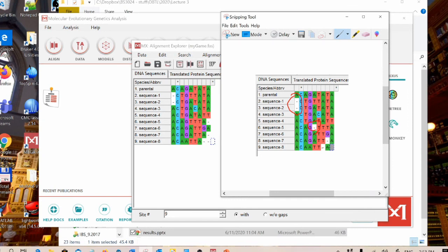The failure of the alignment comes from the fact that the percent of mutation is very high for this sequence. Normally we have mutations coming in the order of 1 per 100 nucleotides or so, and here it is 1 per 3 or 4 of them. Therefore there is less information in the alignment which can be used by the algorithm. But that is the general problem, and I believe we have to be aware of this problem.